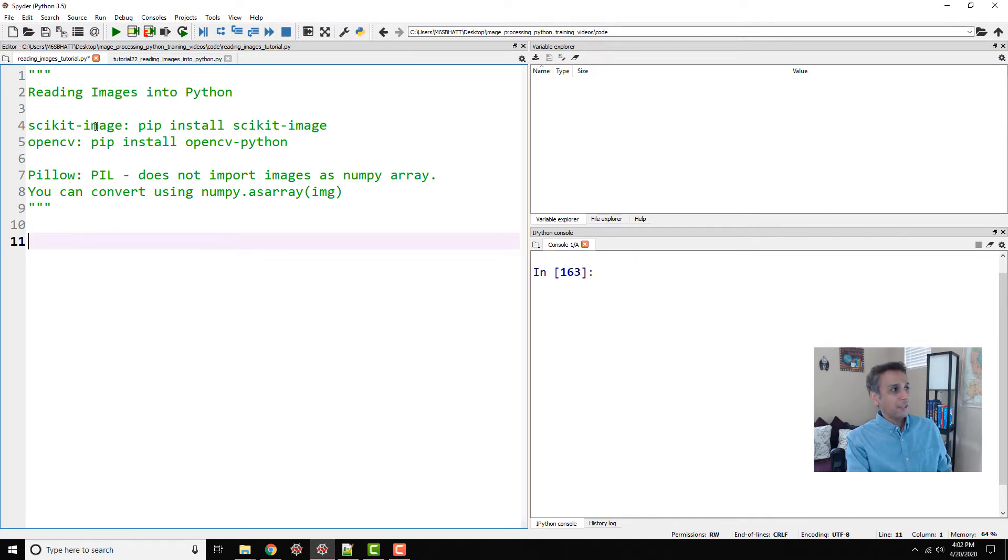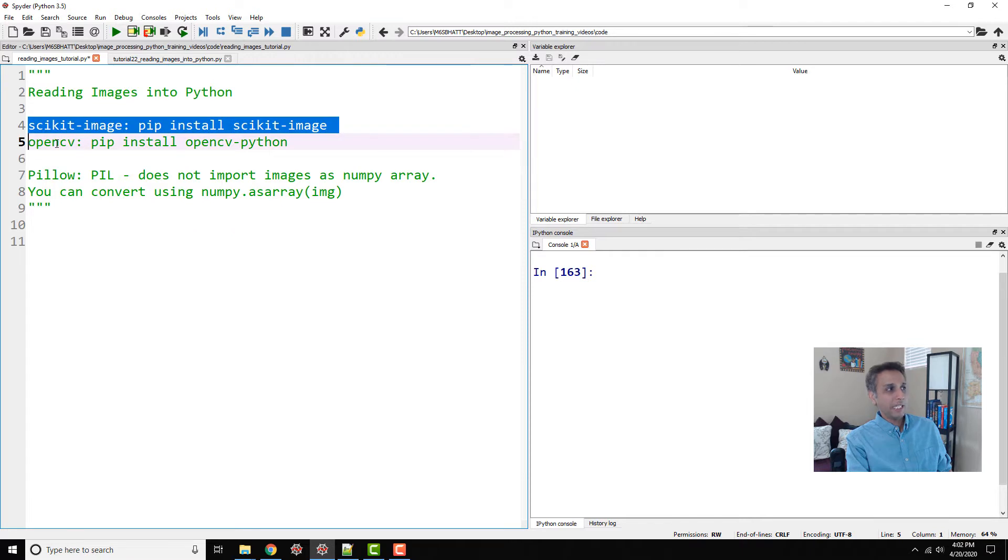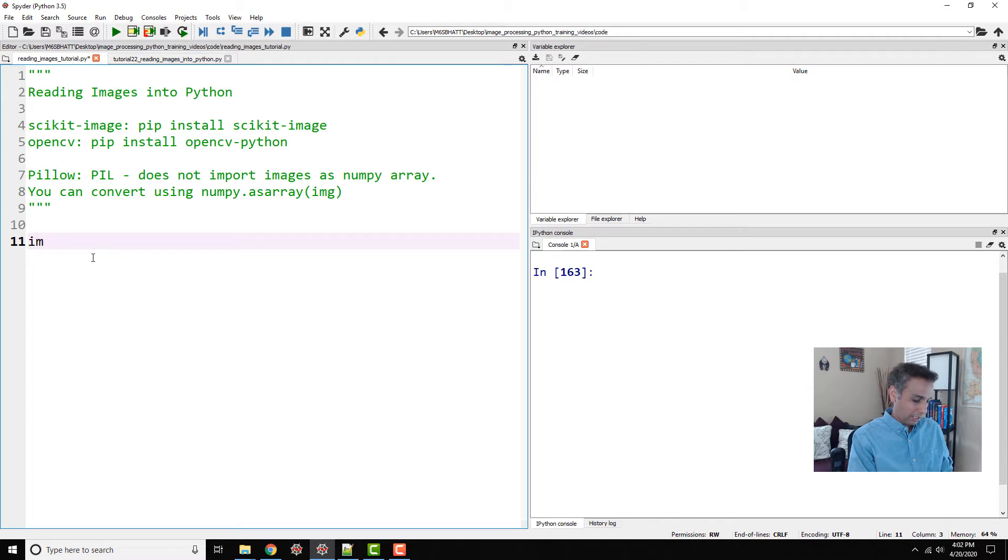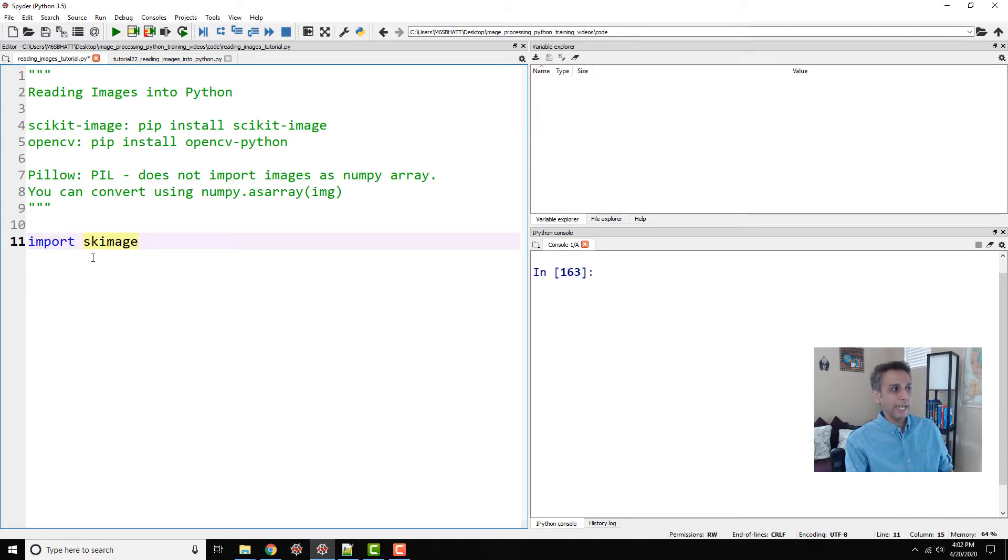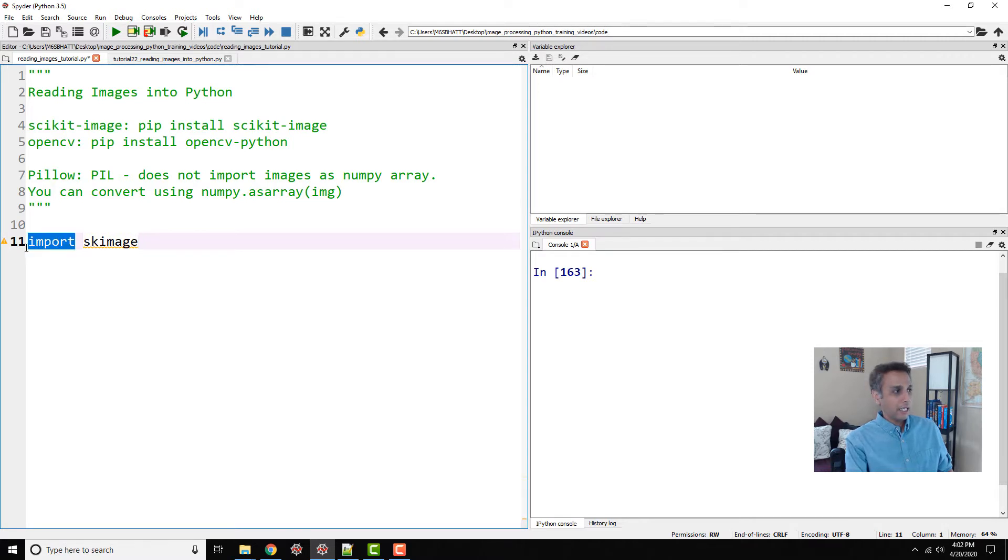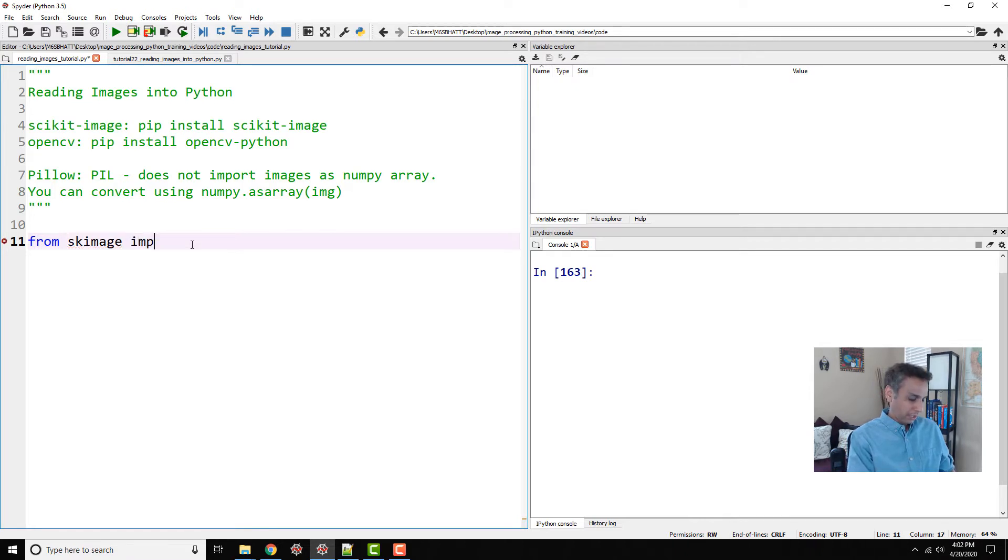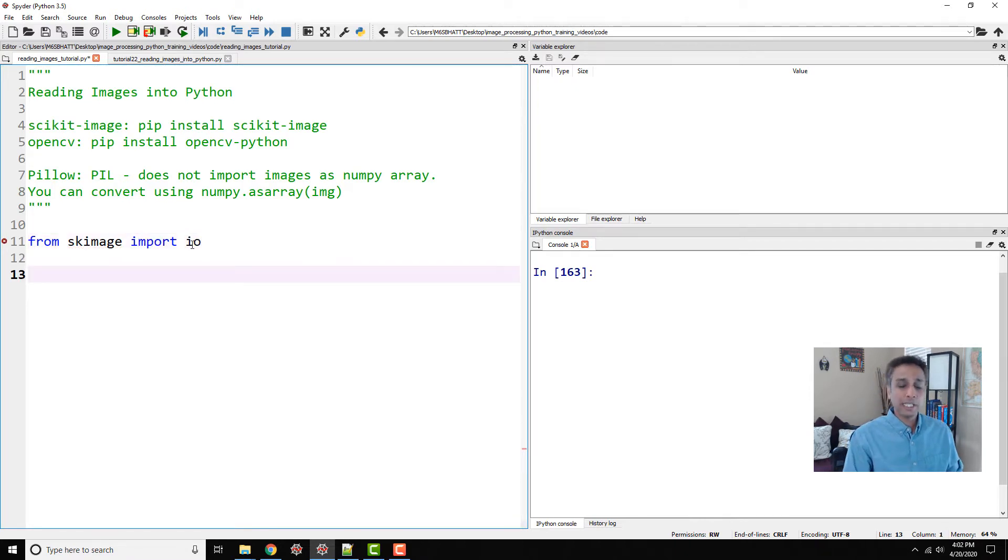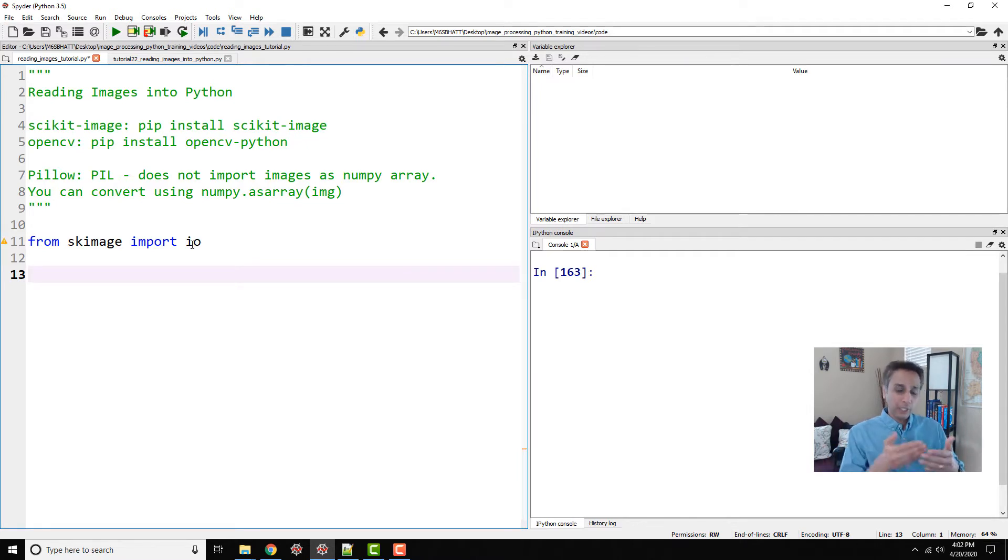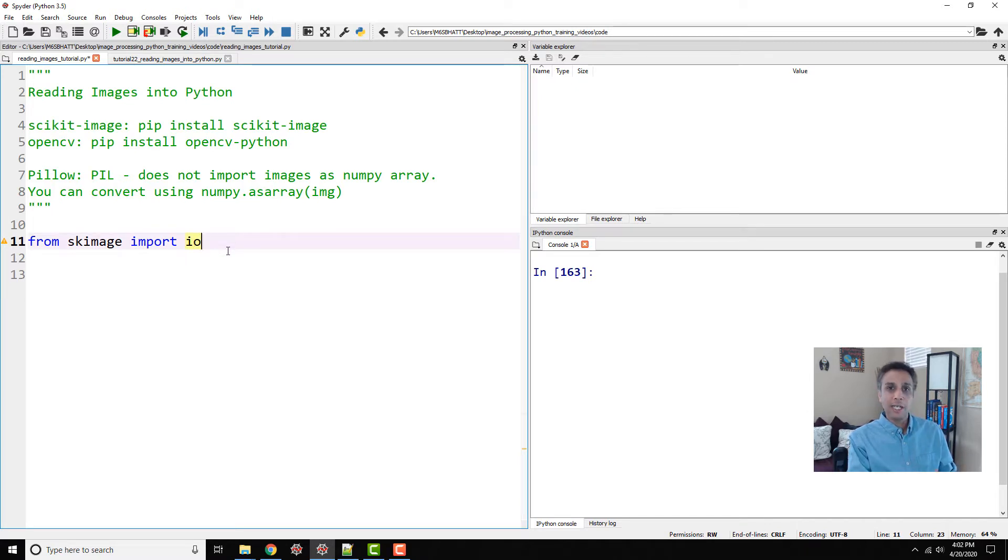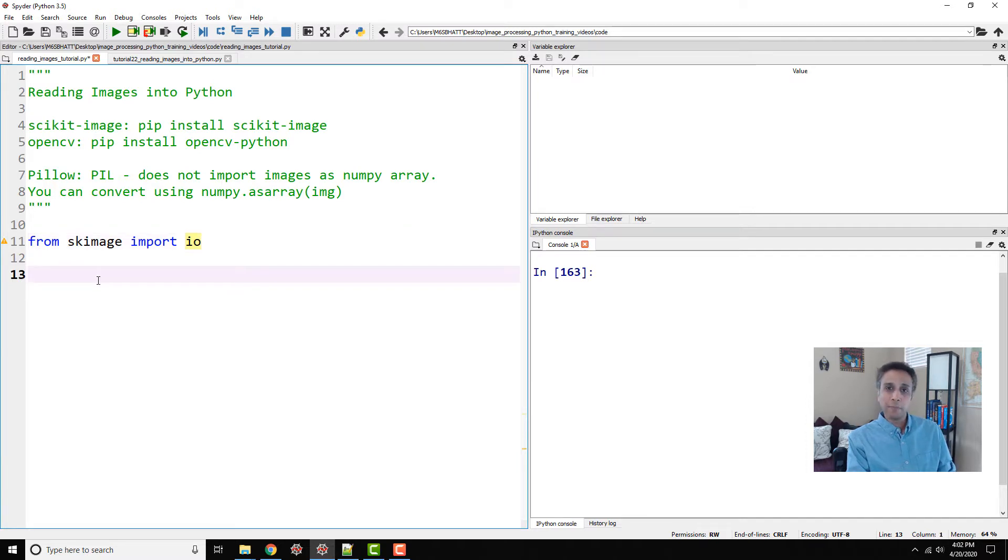So now let's start by focusing on scikit-image. The way you import scikit-image once it's installed is import sk-image. That imports the entire library. Now let's import from sk-image, let's import io. If you import sk-image it imports everything, but I'd like to import only the classes or only the functions that I'm interested in. So let's import io. It keeps things simple.